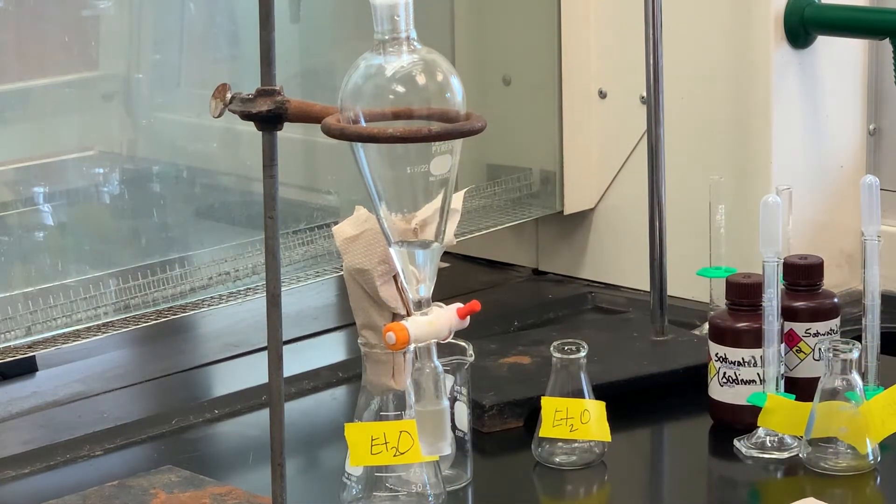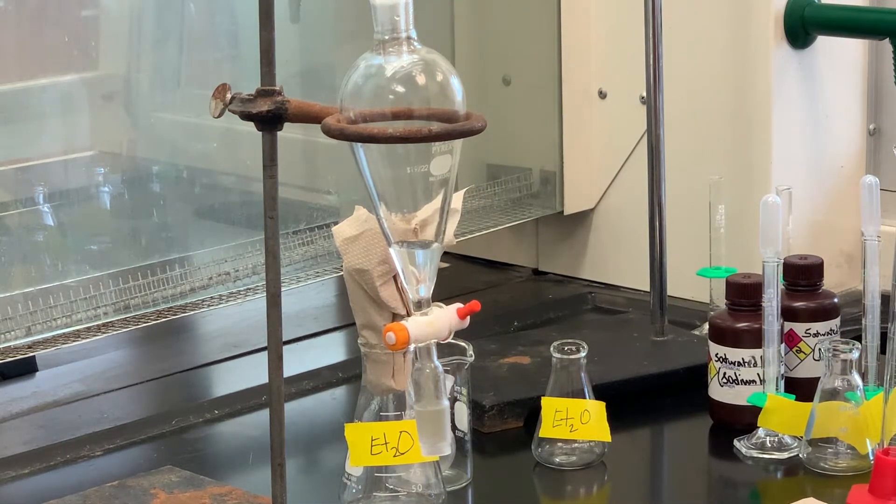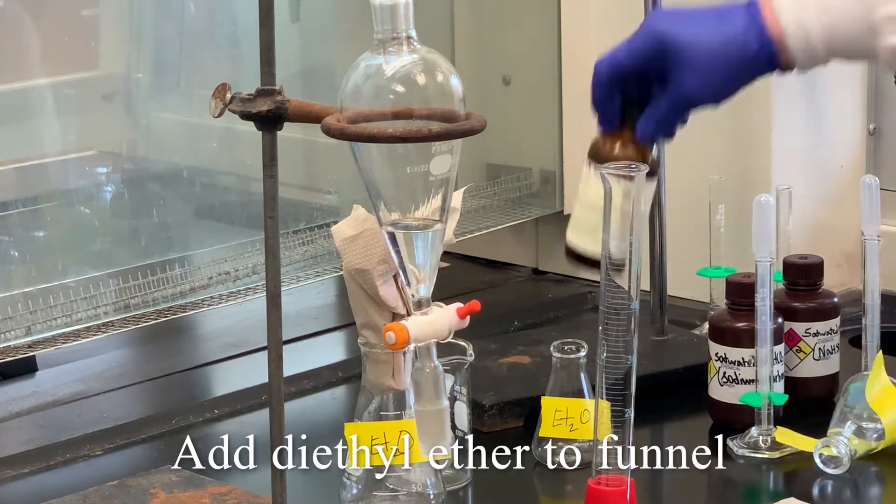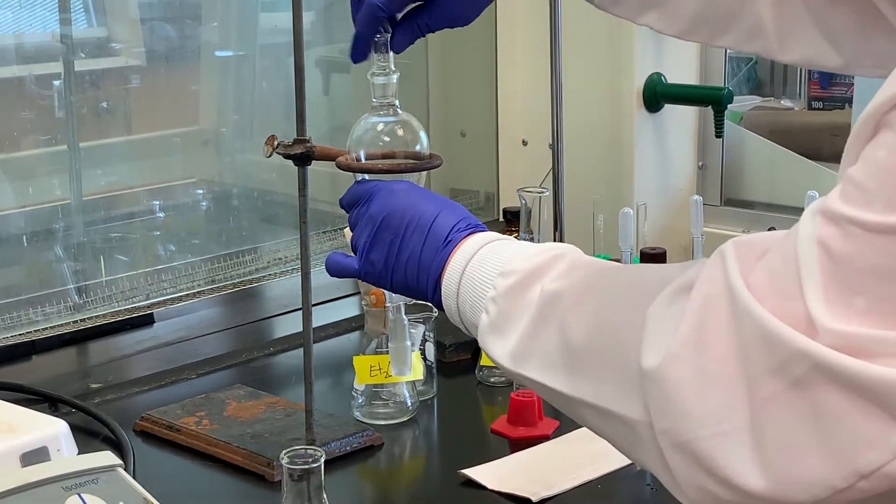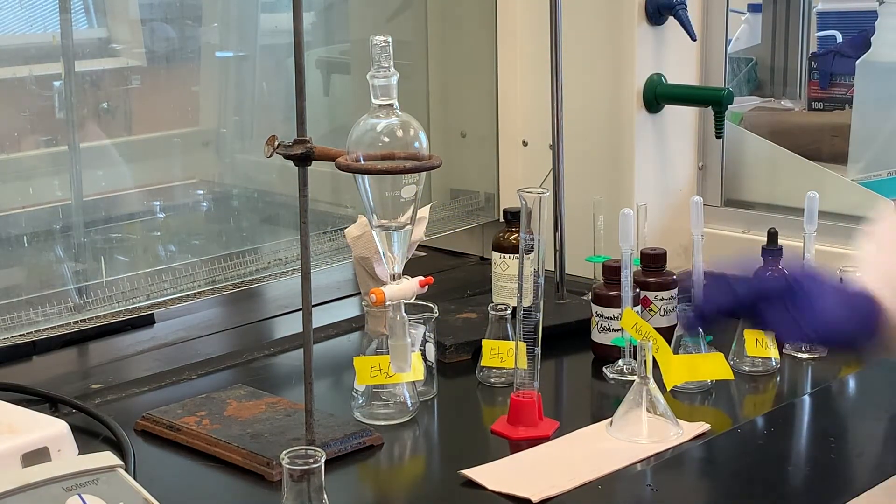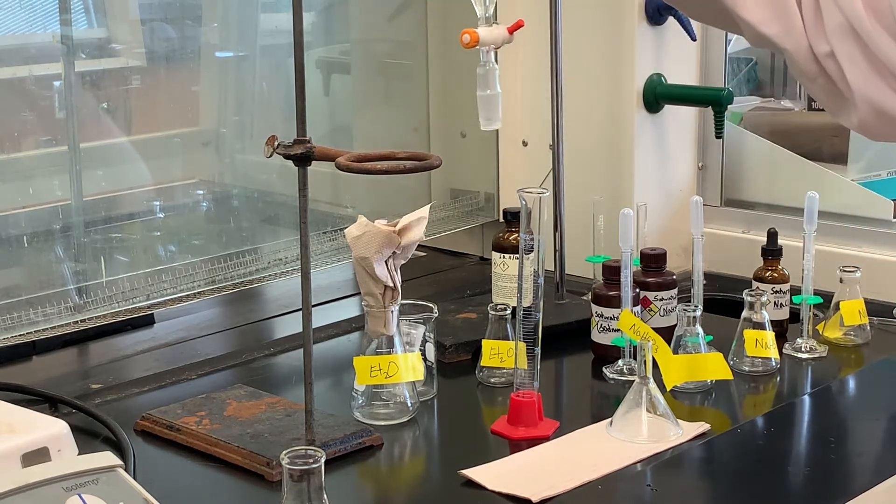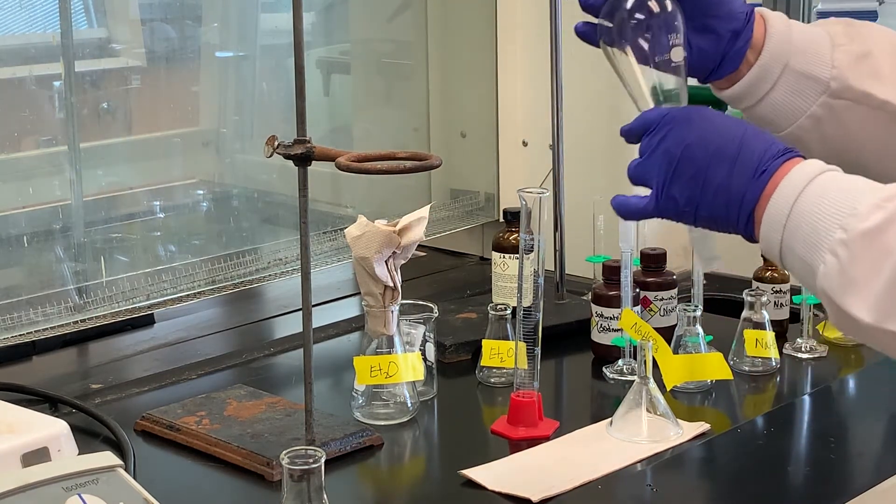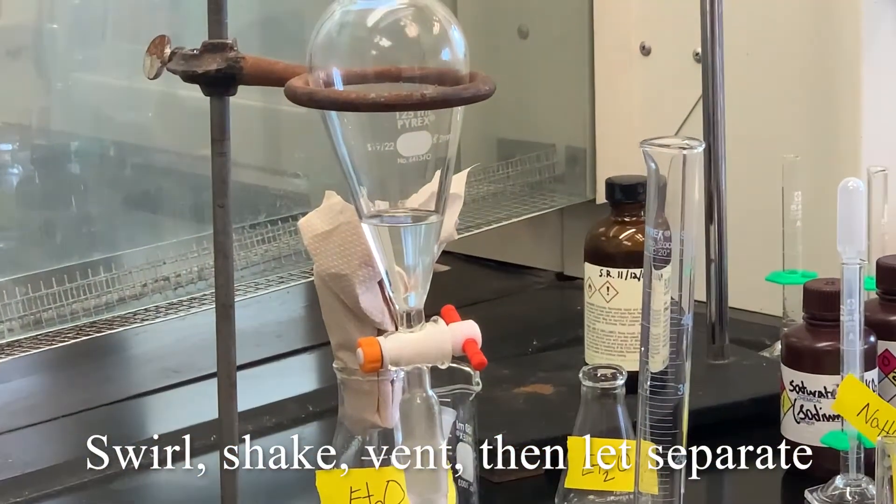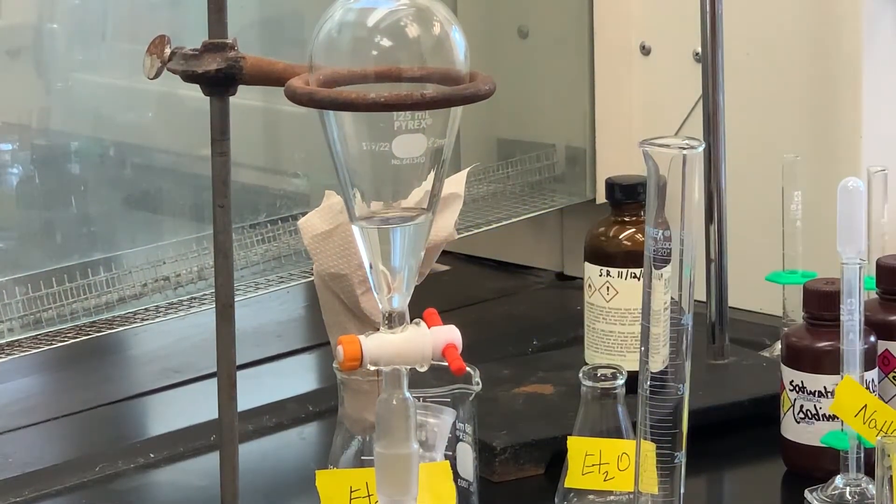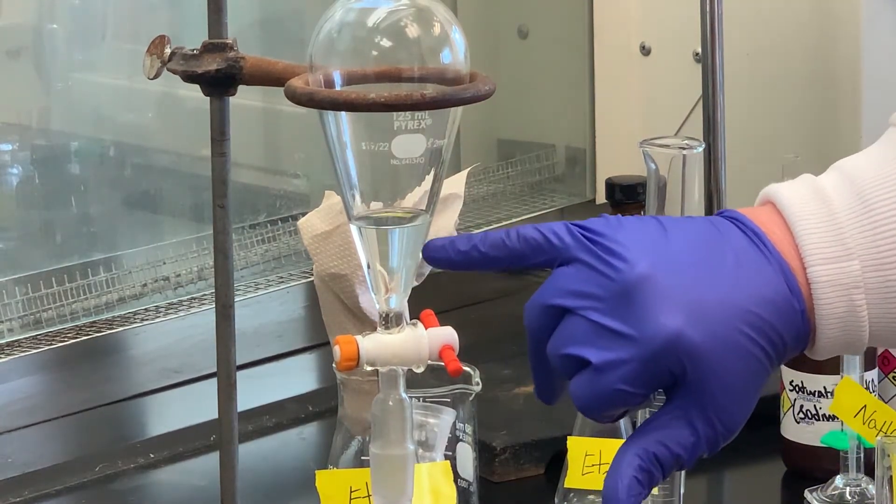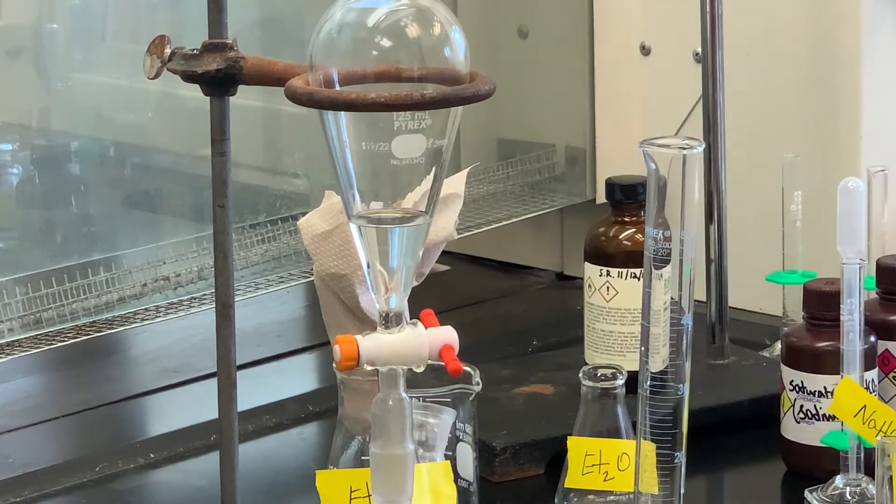And then we'll use another five or so mils of the diethyl ether. Always when you insert the stopper, just give it that twist. Now I haven't shaken this yet, but you should be able to see two distinct layers. It's very difficult to see. I'm going to swirl this. It is a very fine line, but you can see right there is where the aqueous and the ether layer separated.